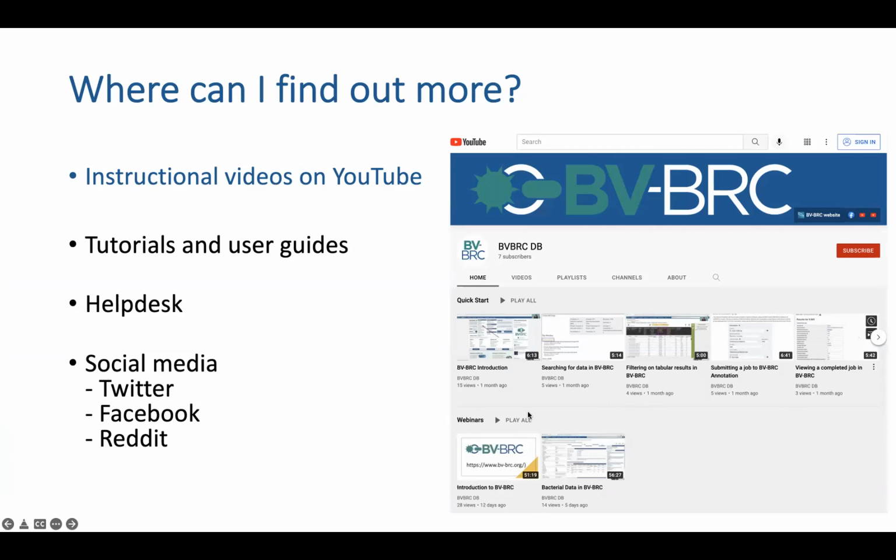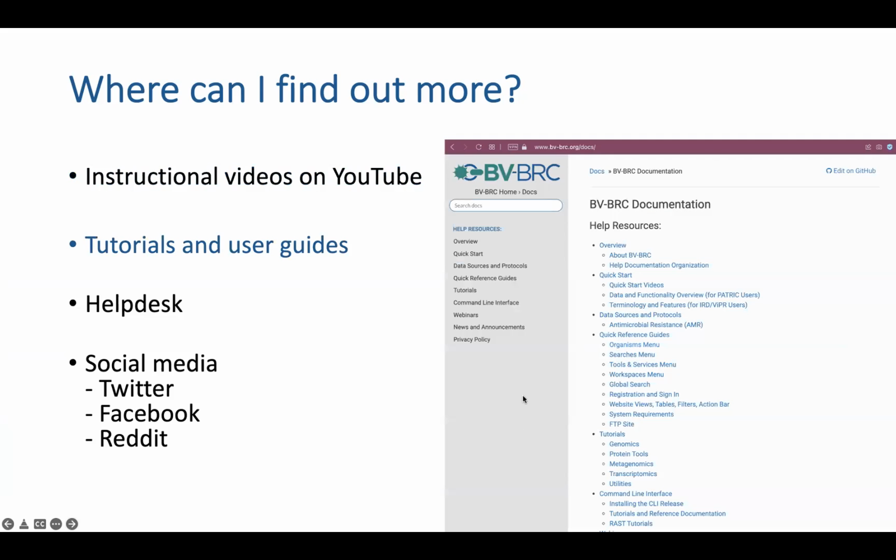And again, of course, we have the webinars that we're recording and uploading here as well. Ron and I and Rebecca and some others have also put together a ton of documentation on how to use these. And these include quick start guides, tutorials for the different tools, and just reference documentation for everything.